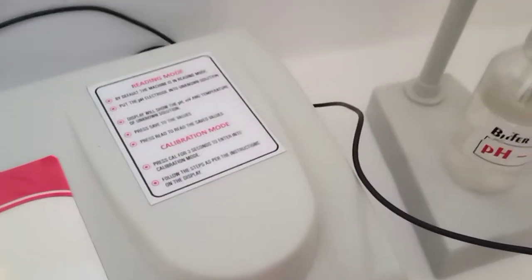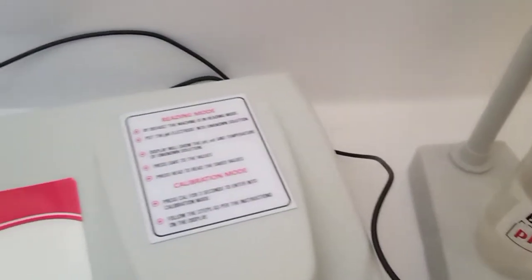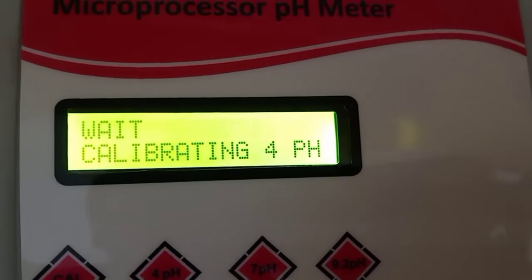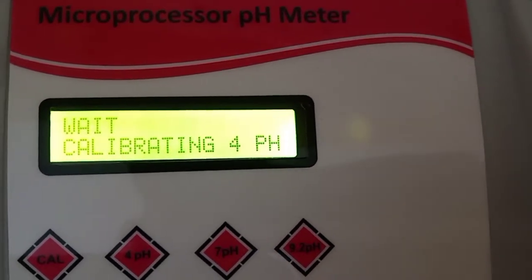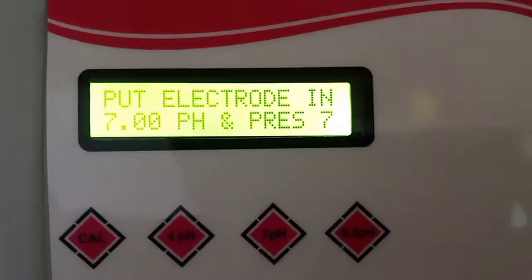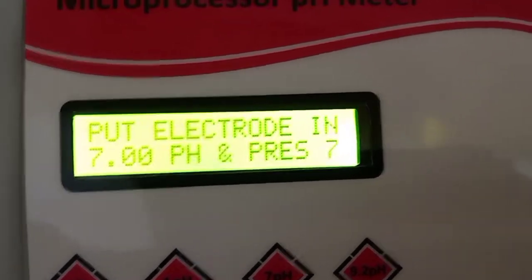Once the machine measures the pH value and saves it into memory, a message automatically appears indicating that 4 pH calibration is over. It takes approximately 50 to 60 seconds. Now the machine is demanding 7 pH.